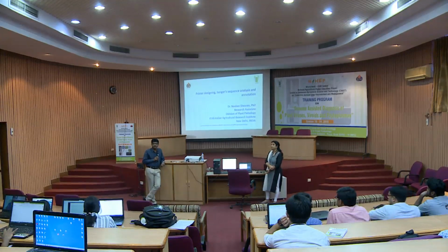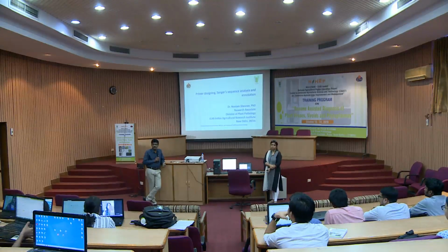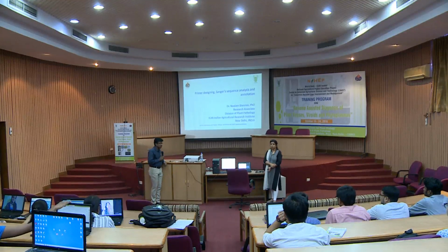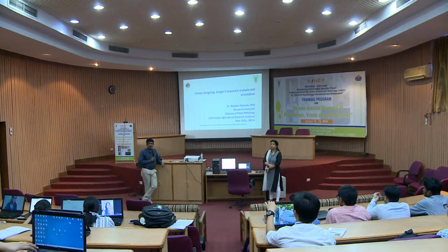Dear students, I welcome you all for this afternoon session. I already indicated this morning, this afternoon is entirely for bioinformatic analysis, and we have taken the topic primer designing, Sanger's sequence analysis and annotation. And this lecture will be delivered by Dr.